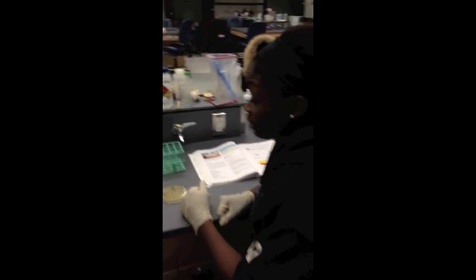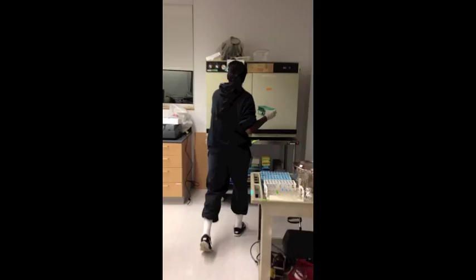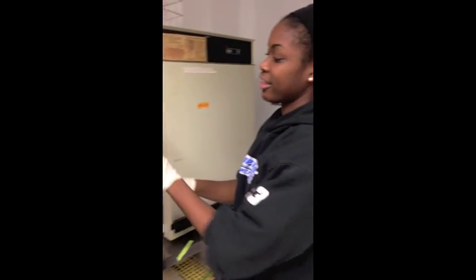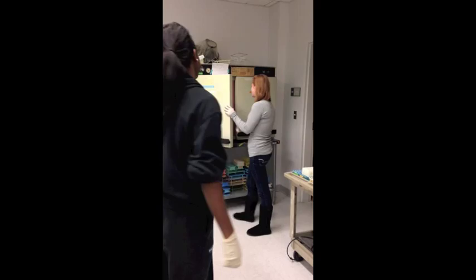Now we're going to incubate the two tubes for 48 hours. We'll check on it in two days. I'm so excited to see our test results. Me too.